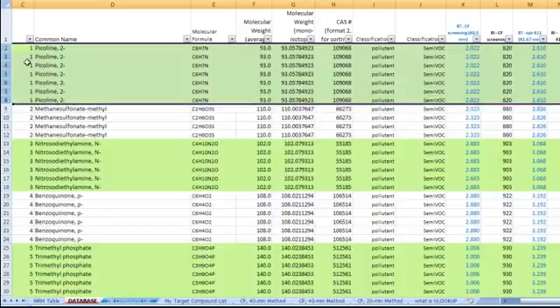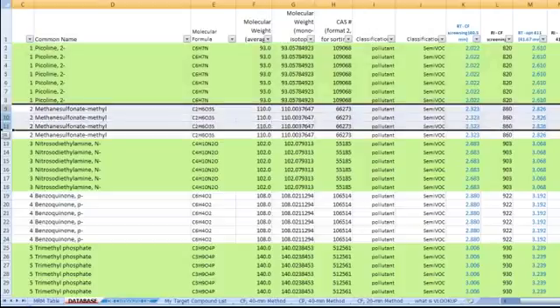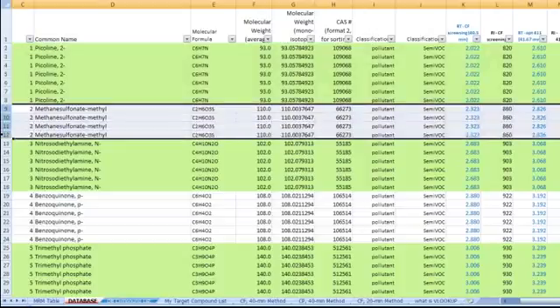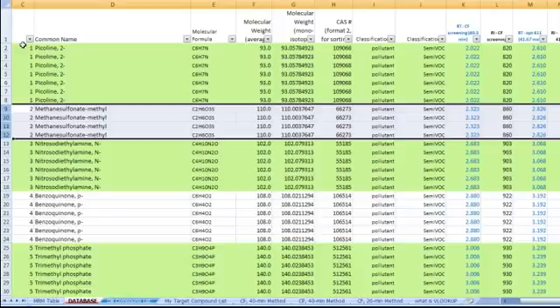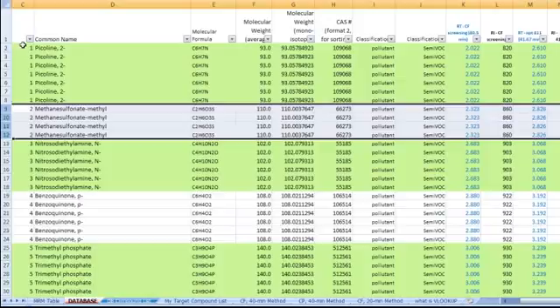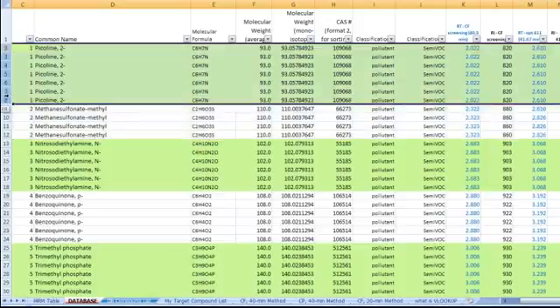They are separated by color bands, green, white, green, and so on. Each band has multiple rows that represent multiple MRM transitions for that compound. This allows us to work around matrix interferences by using different MRM transitions.